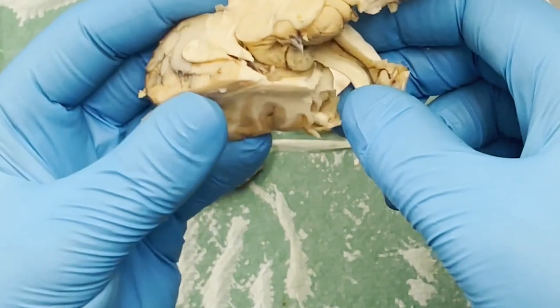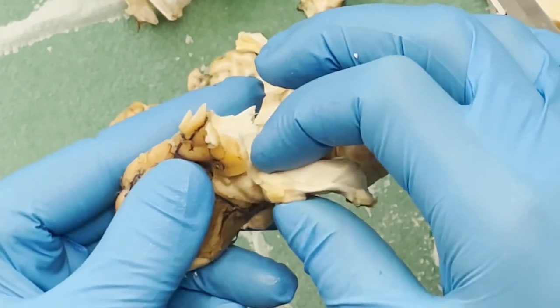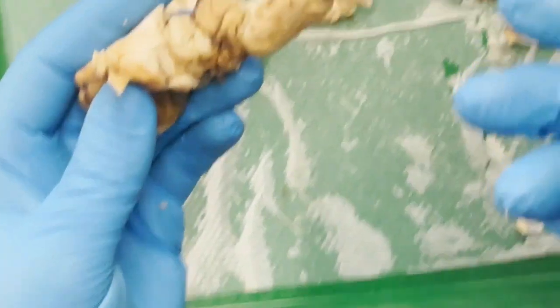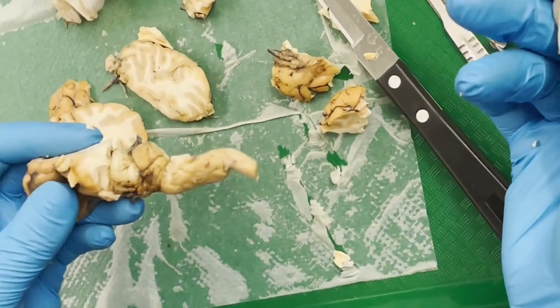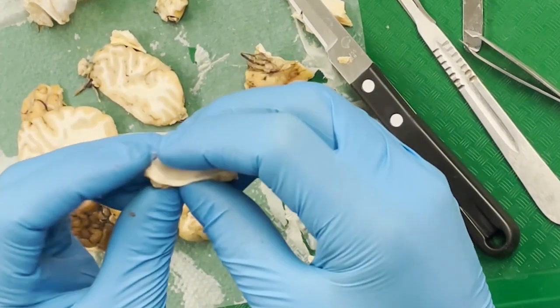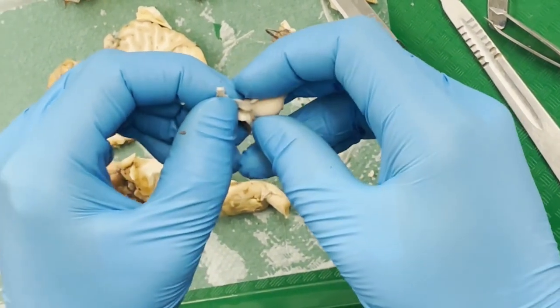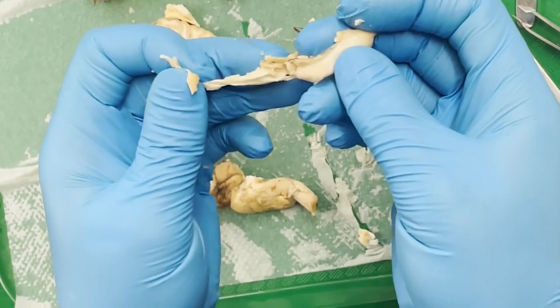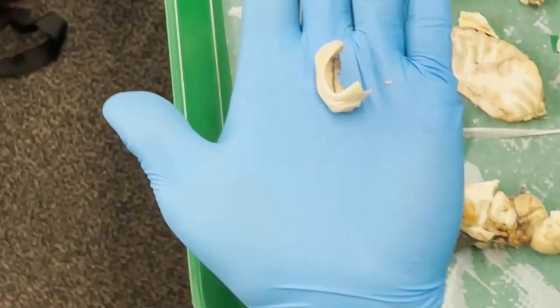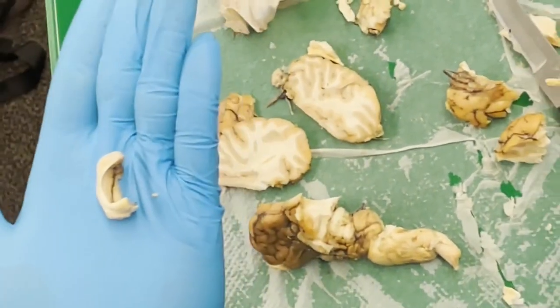So now we've peeled it back, and I think this about does it. I know, anticlimactic ending. But yeah, this is the entirety of the hippocampus with a little extra stuff still stuck on it. Like the parahippocampal gyrus stuff, I could kind of just peel off the rest of that right here. There we go. Something like that. But yeah, this is the hippocampus in its entirety, that C shape that I mentioned before. The dorsal parts up here, the ventral parts up here. And so, now you do it.